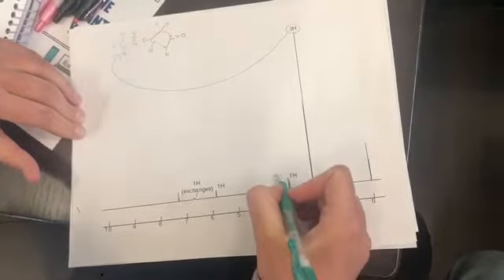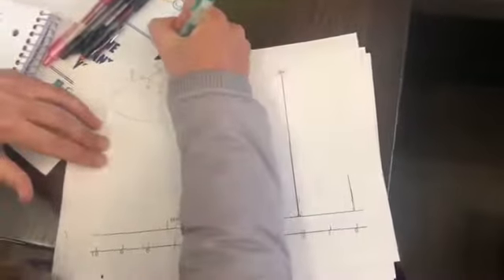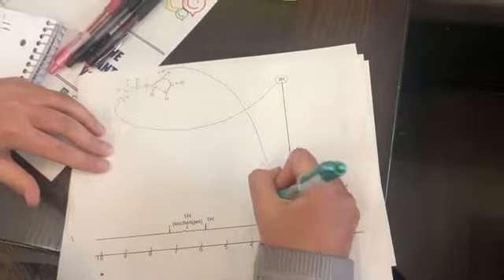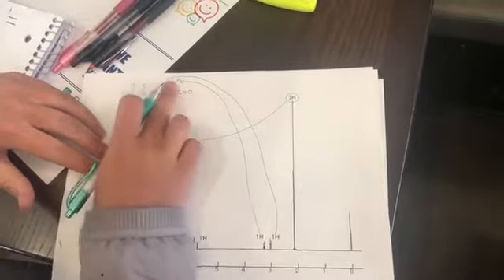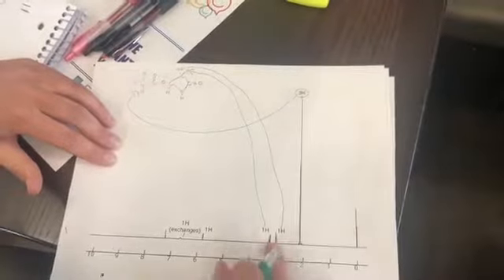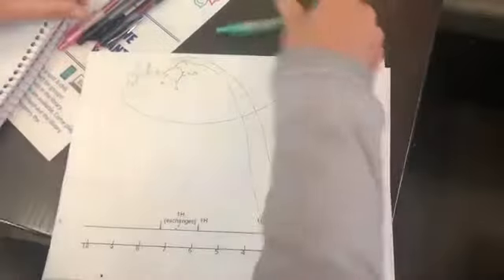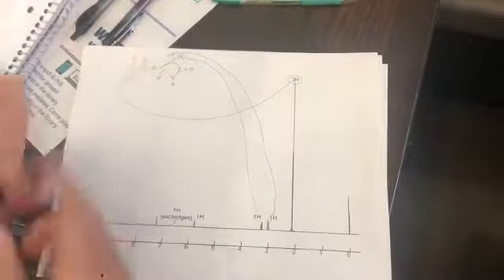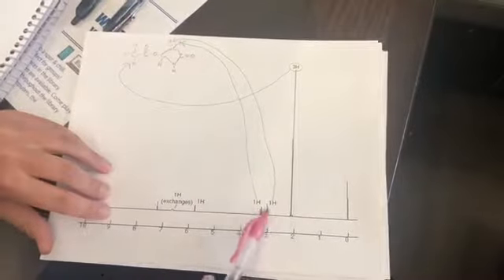And so these 2 hydrogen peaks, the lesser electronegative hydrogen is this one, and then this one belongs to this one right here. And so these are in the ring, and there's an oxygen here. That's why this one's a little more shielded than that one, but they're pretty similar hydrogen regions, so that's why they're so close together. And then the next hydrogen region, these 2 also have pretty similar environments, but they're just a little different. And all these 3 have the same hydrogen environment.